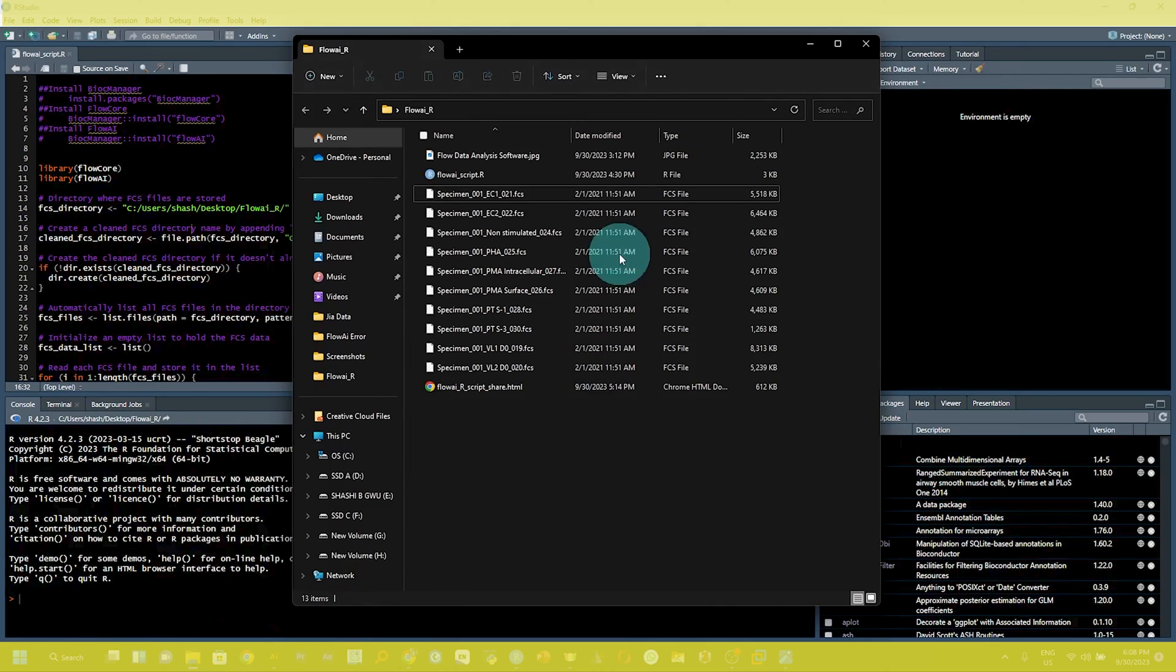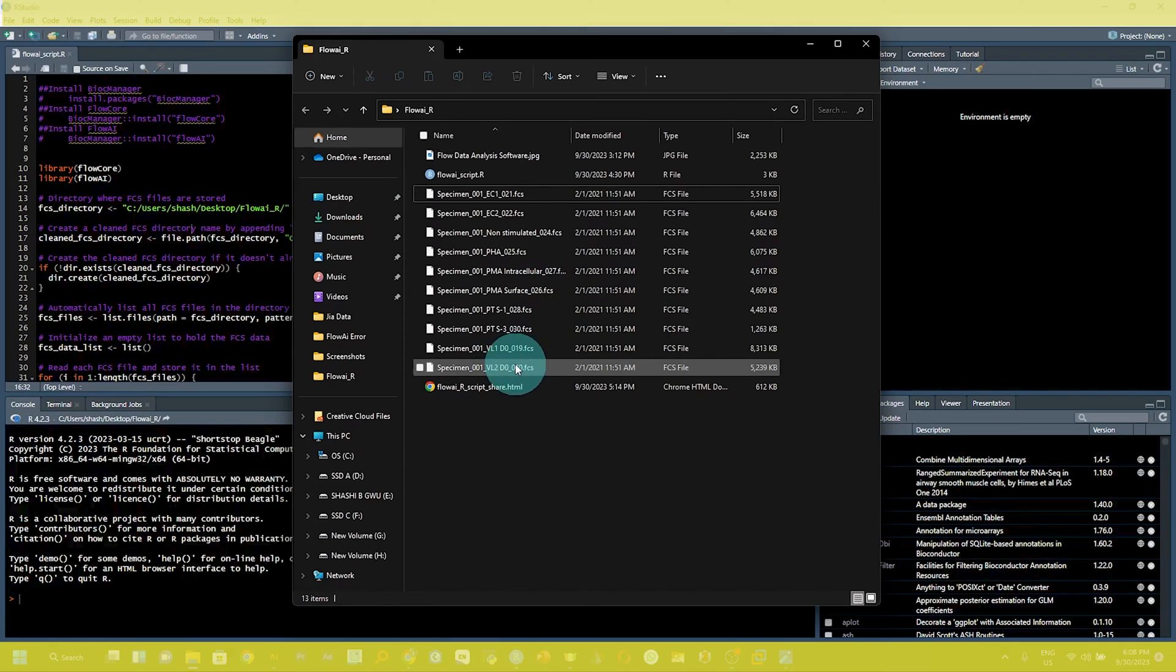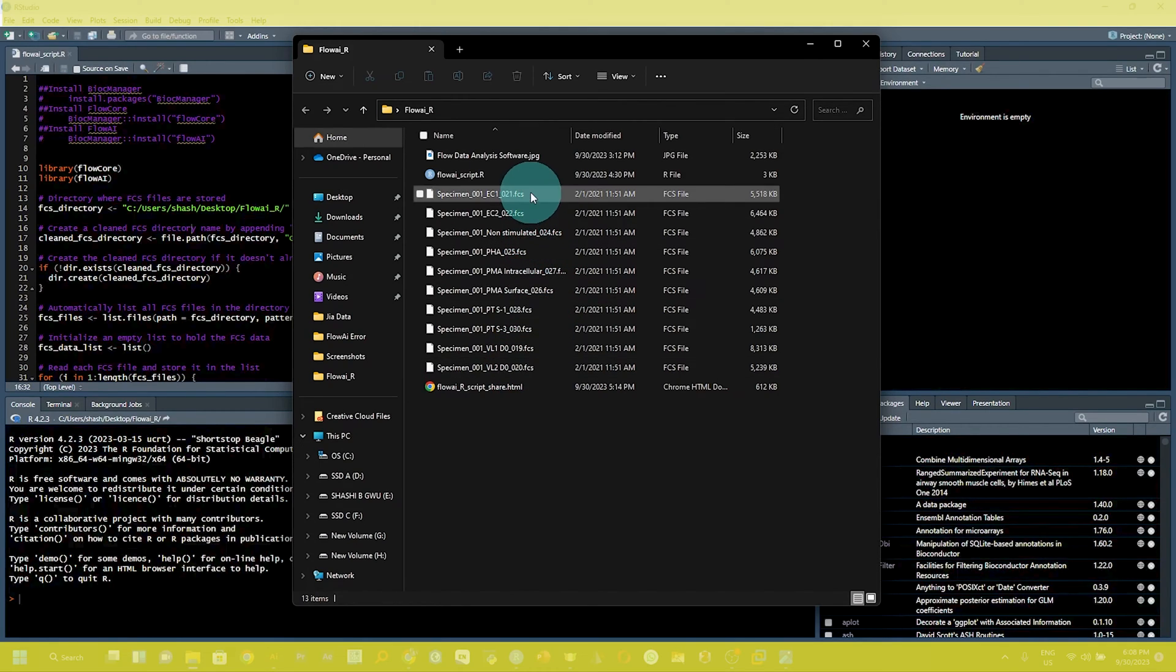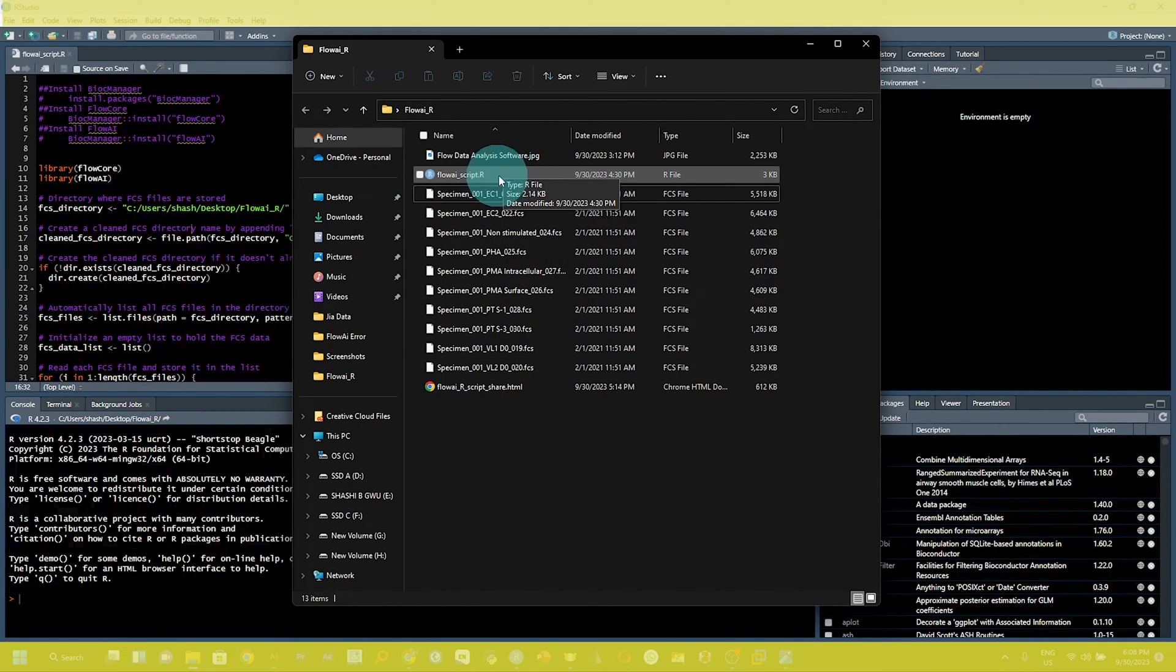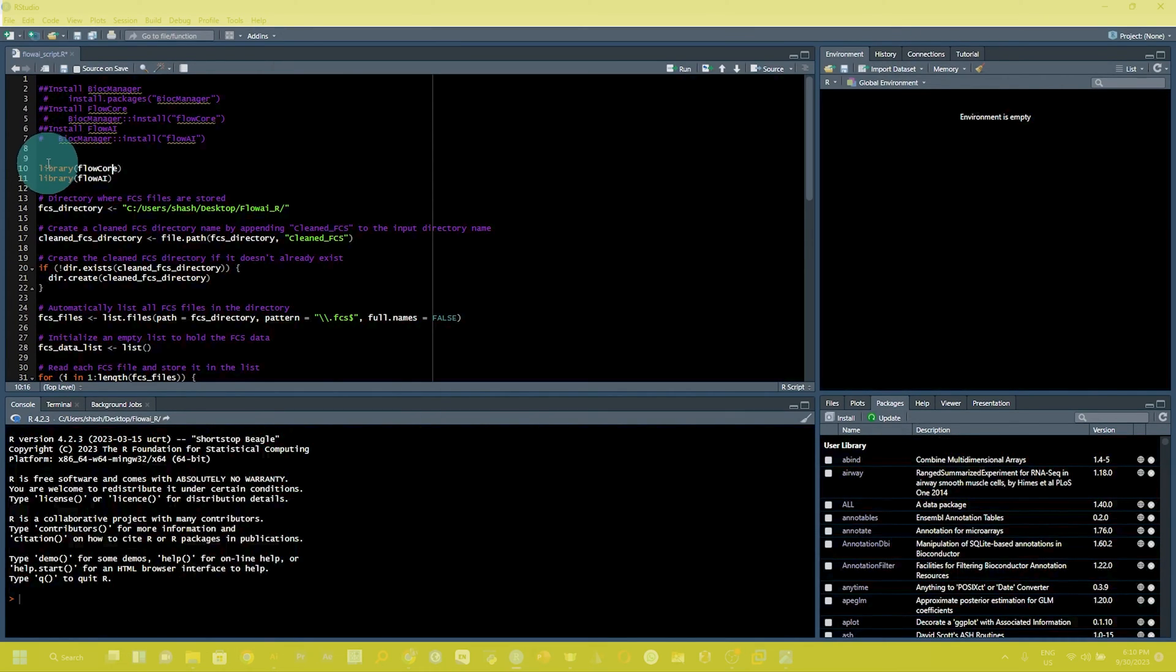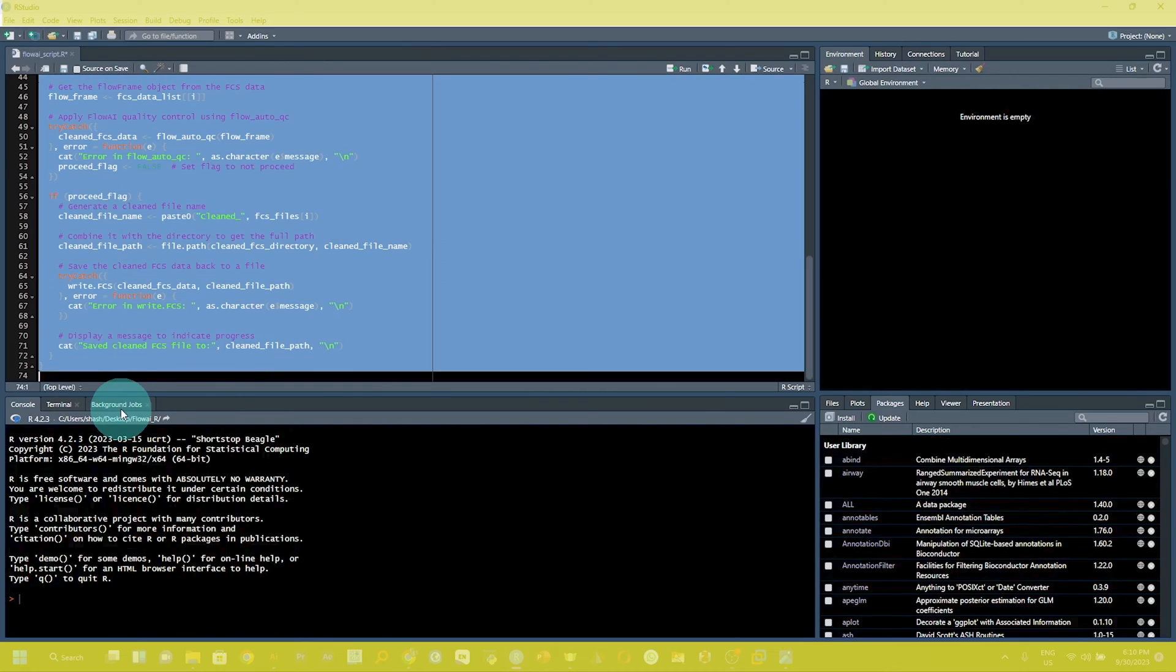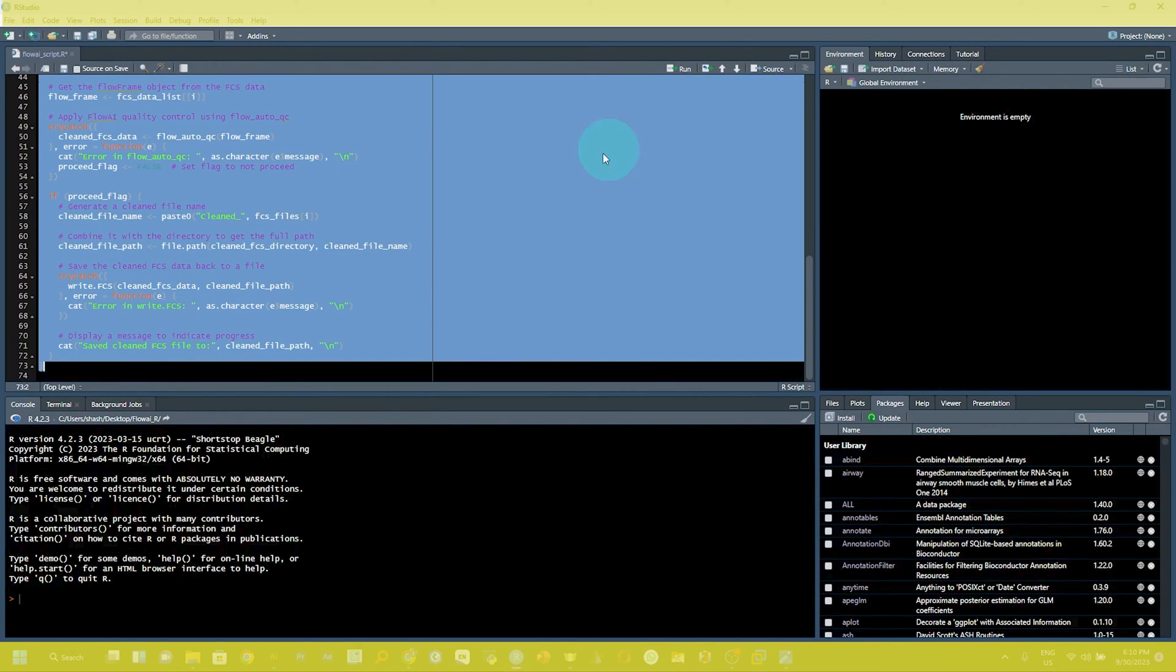Here you can see I have a flowai R folder at desktop, and I have 10 fcs files and the R script file as well in this folder. So I will use these files for the cleaning. I am going to select all the script and click here on run.